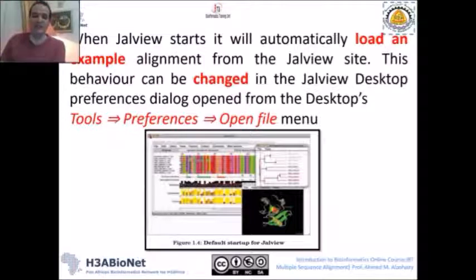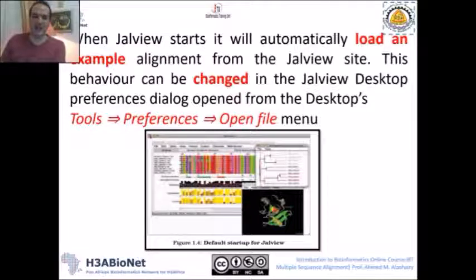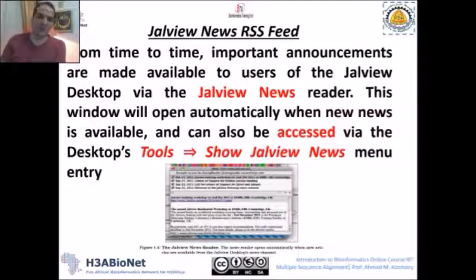At the beginning of JalView, you always see an example project that helps you understand and see different features of JalView. If you would like to open or not open this project every time, you can change this from the Tools menu, then Preferences, then Open File — check or uncheck the option. You can also choose whether to see the news from Tools, then Show JalView News.